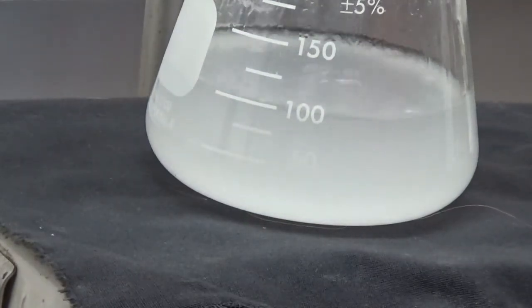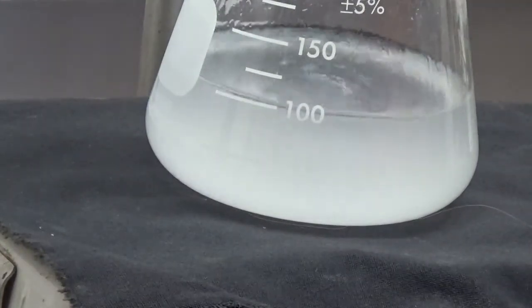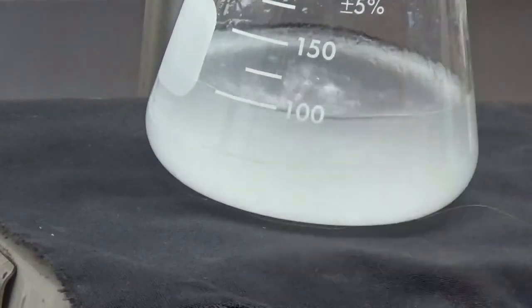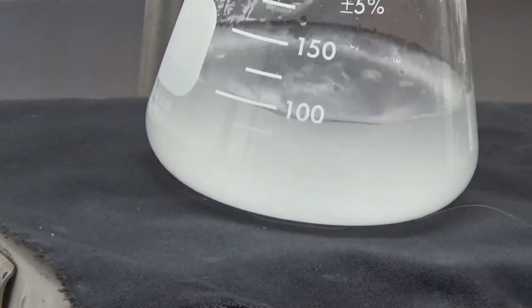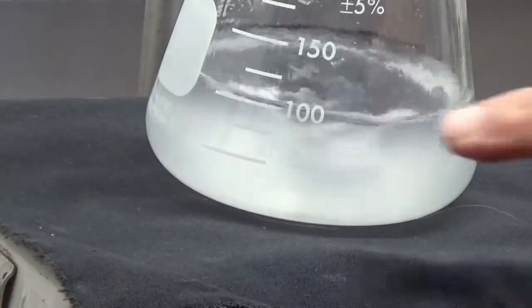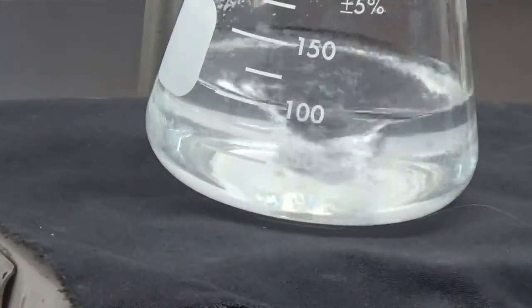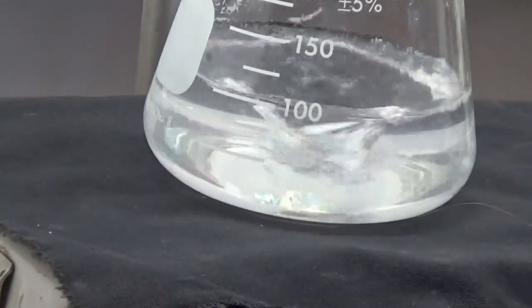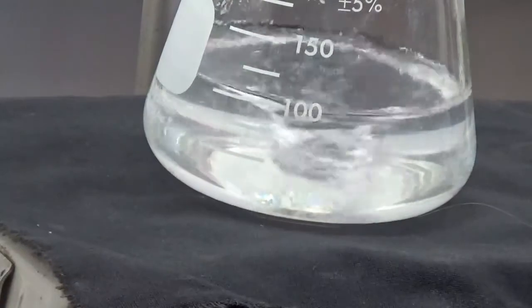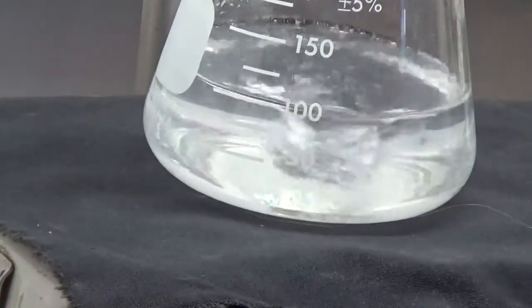Still cloudy. It's getting close. I might be there. No, not quite. It's getting close though. 2 drops I'm gonna add. Still looks cloudy on the side. It's very close. Actually, I think it's done. It's done. Reading 11.33.